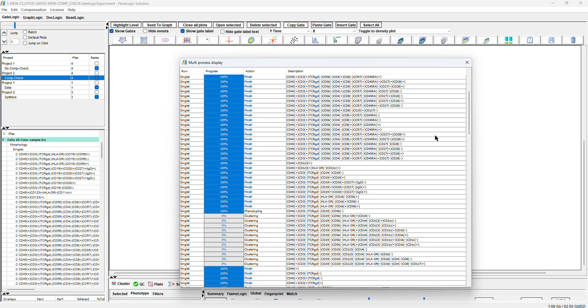And when we finish, because you have all the phenotypes built, in any case, we build the phenotype in the background. So we have all the possible combinations inside our files. We can do an exploration of data and try to understand a bit more about these complex files, because with 25 colors, the complexity gets really big.